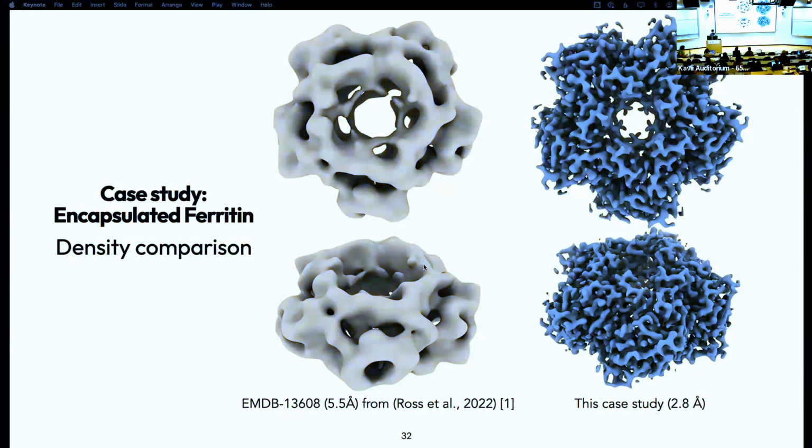But what this kind of shows to me is that doing all of this intricate geometry work and using 3D classification to remove as much junk as possible can actually have pretty big impacts on getting a better structure. Because we removed the junk, we're giving local refinement better orientations to start out with, and we're finally getting the D5 symmetry aligned with the correct axis and then imposing it. Okay.